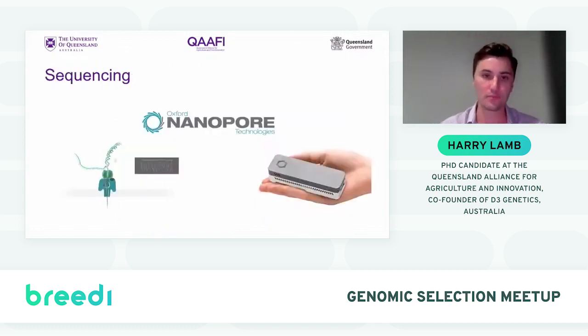When it comes to sequencing, there's a few different brands or technologies that you can choose from. And there's one particular technology that we use in our lab, and that's nanopore sequencing. The reason we use nanopore sequencing is because it is the only portable DNA sequencing technology available at the moment. You can see the device there is about the size of your hand. So it's extremely portable and it plugs directly into a laptop.